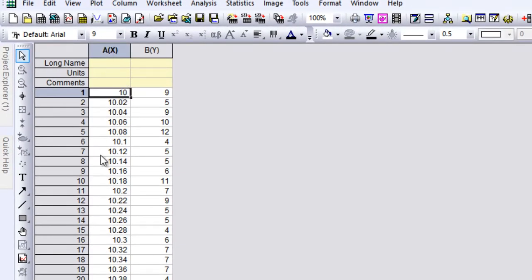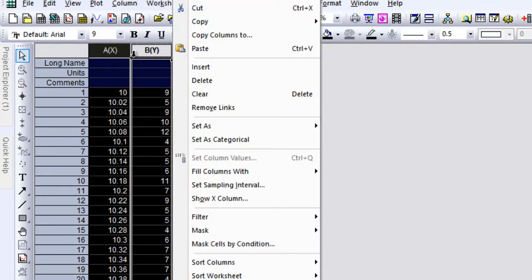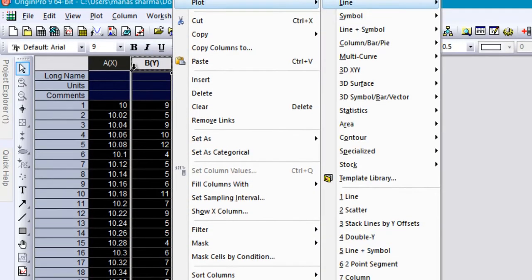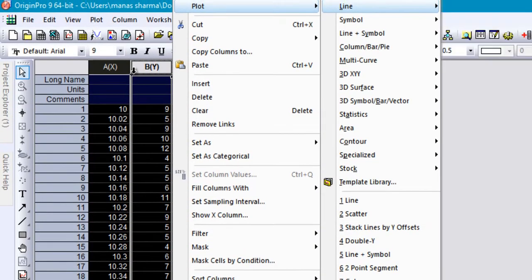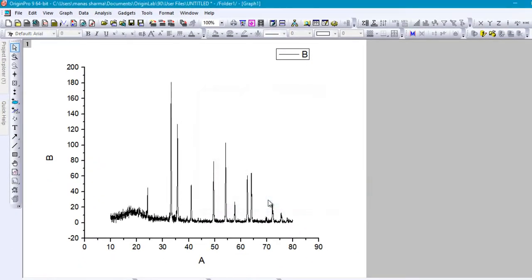In the X axis values you have the theta angles, and in the Y axis you have the intensity of the peaks. Just go ahead and select these two columns, right-click on them, then select Plot > Line > Line. Here you can see a nice XRD pattern in your Origin graph window.